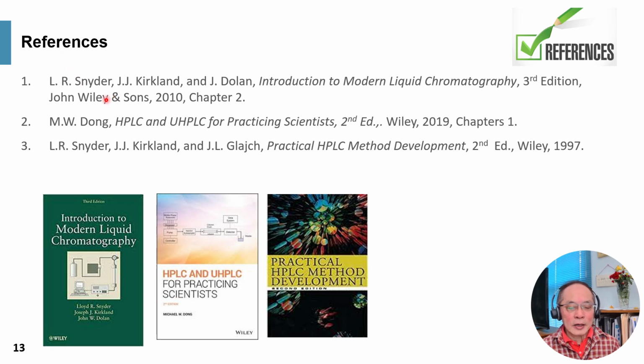Here are some key references. First one is the book by Snyder, Kirkland, and Dolan. Second one is a more modernized version, HPLC and UHPLC for Practicing Scientists. A third one is also a very important book in HPLC method development, also by Snyder, Kirkland, and Glajch.